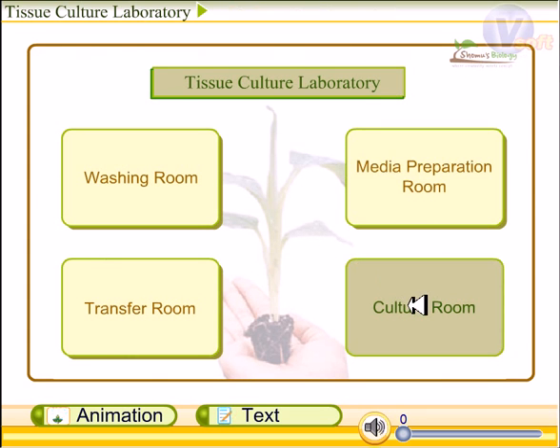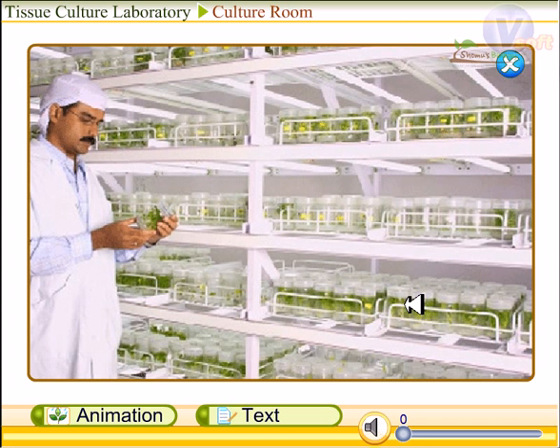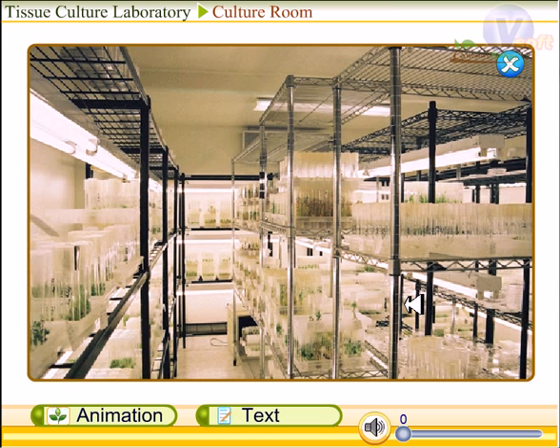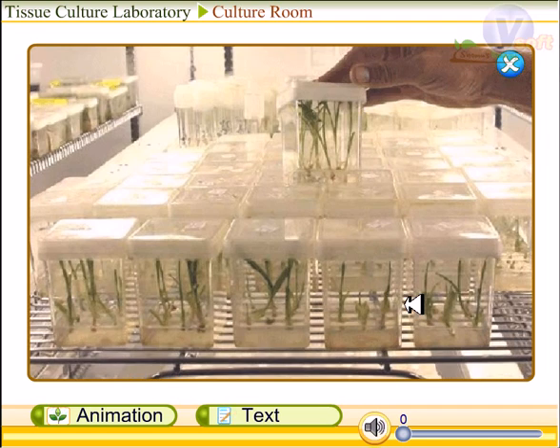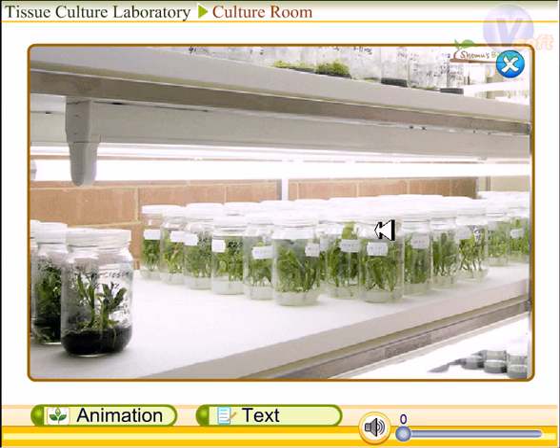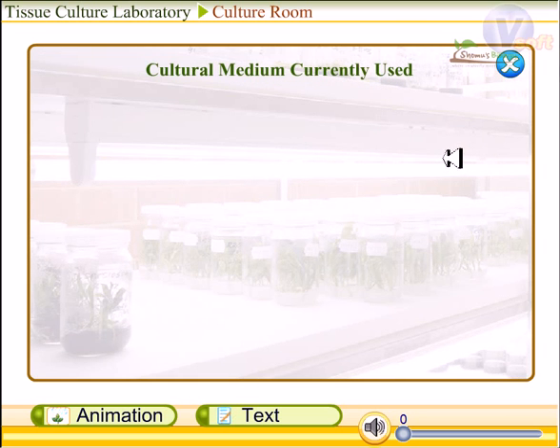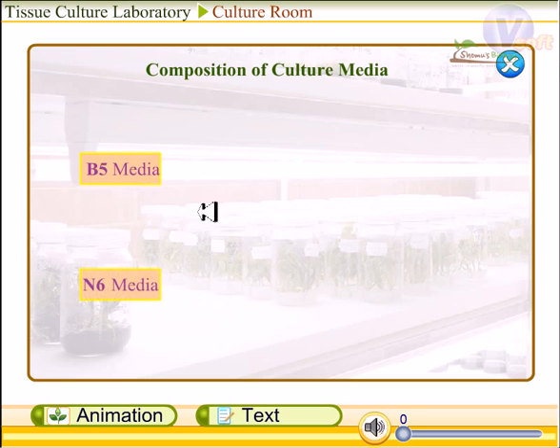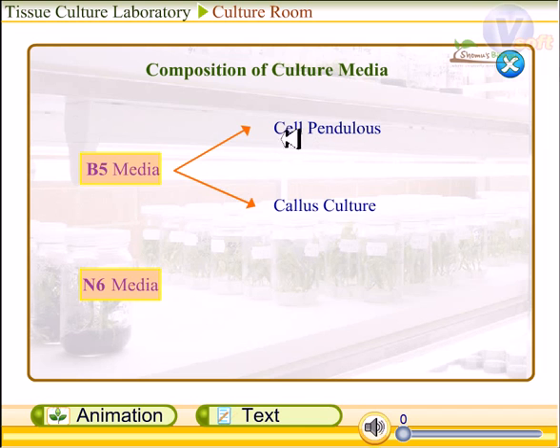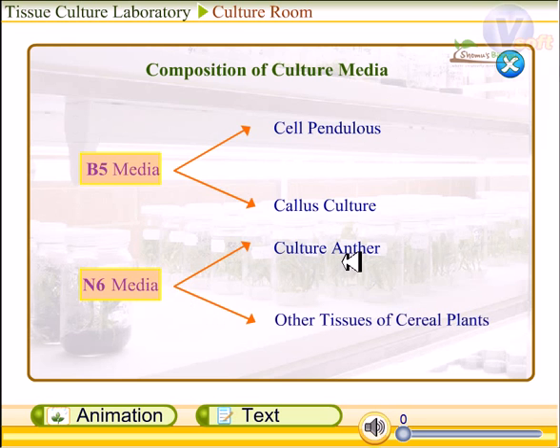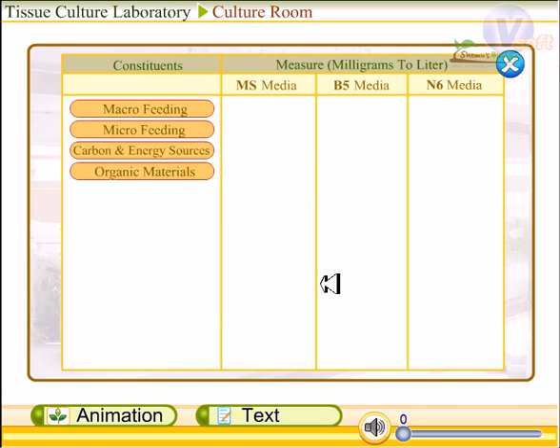Now let us talk about the culture room. The culture room provides all the conditions needed to support plant growth. It is used for the development of media such as B5 media and N6 media. B5 media helps with the growth of cells as well as callus culture, while N6 media helps in anther culture and culture of other tissue types from cereal plants.